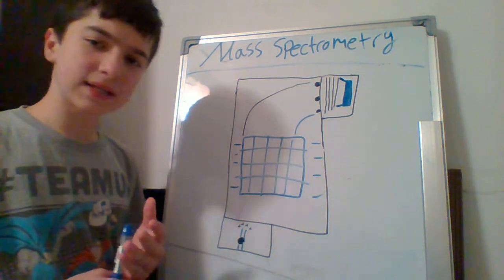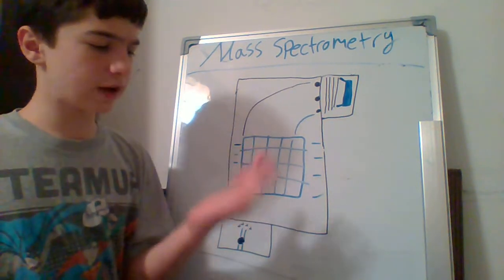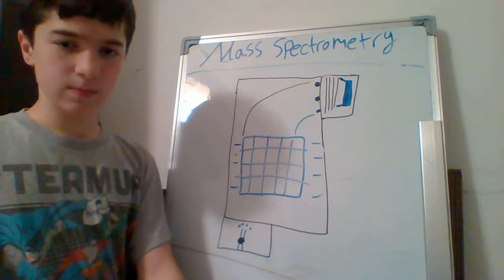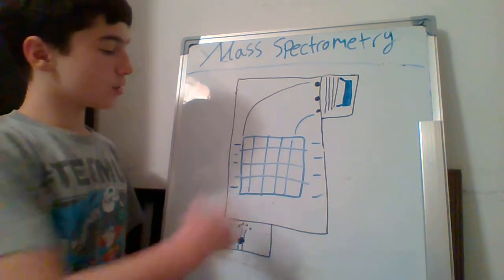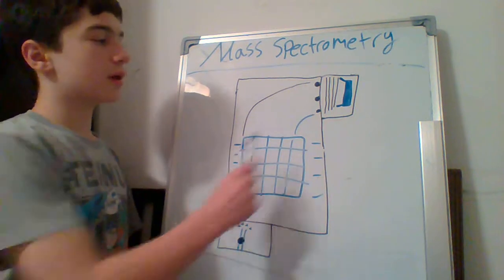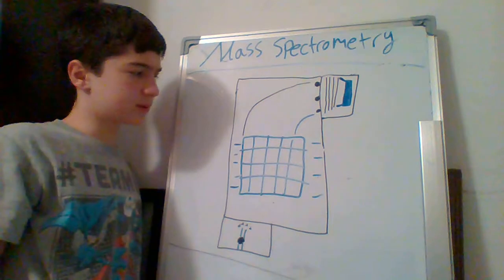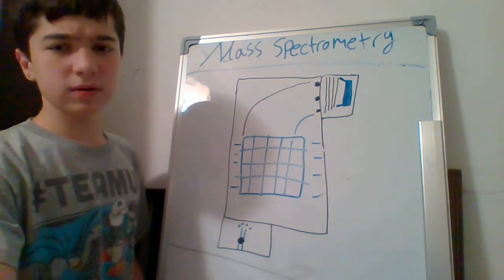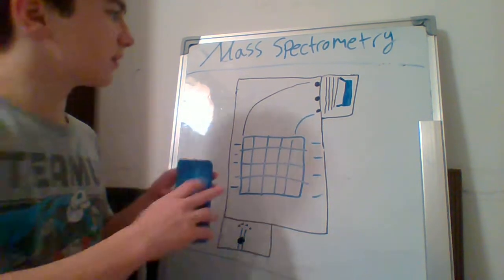So chlorine has different isotopes. We have chlorine 34, 35, 36, 37, 38. So you have 5 different isotopes. I want to know what isotope we have here in that chlorine sample. So we turn on the mass spectrometer, everything goes on, and the mass spectrometer does its job. So after getting the signal, let's continue and see what happens next.